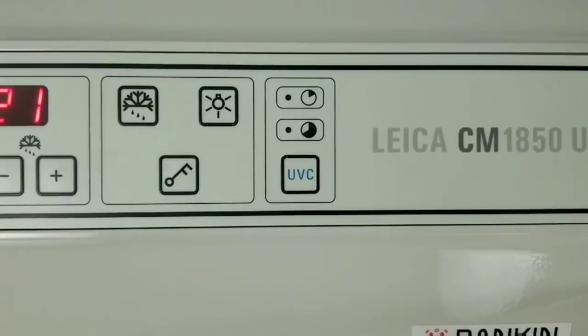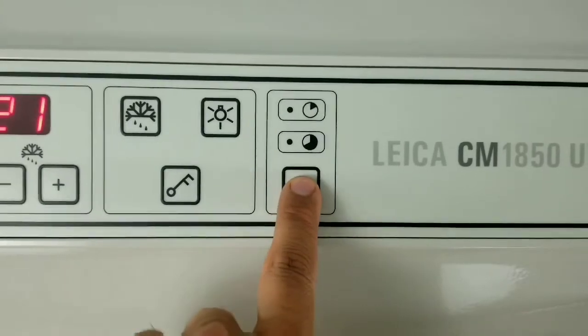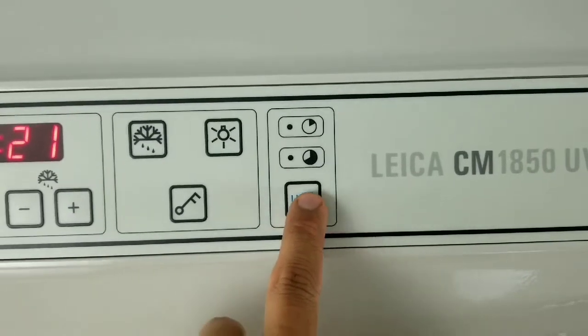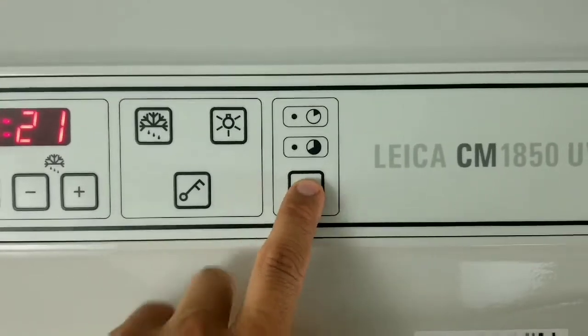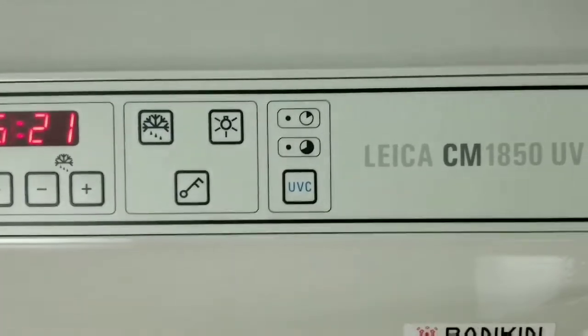If you would like to activate the ultraviolet disinfection cycle, if you press this button one time, the cycle will come on for 30 minutes. If you press and hold it, the cycle will come on and illuminate these LEDs, and the longer cycle is 180 minutes.